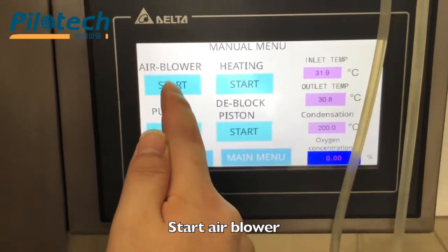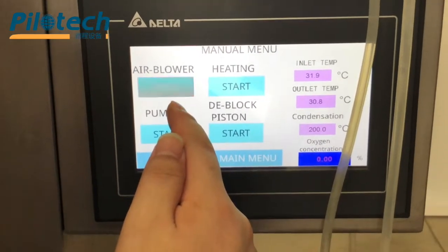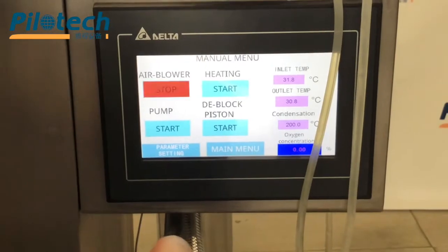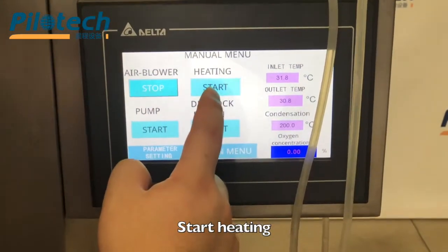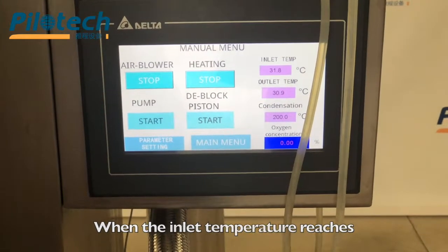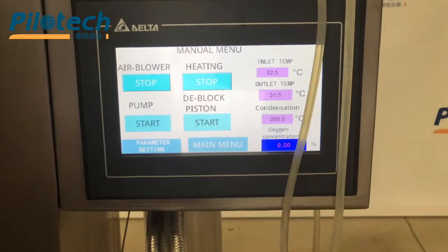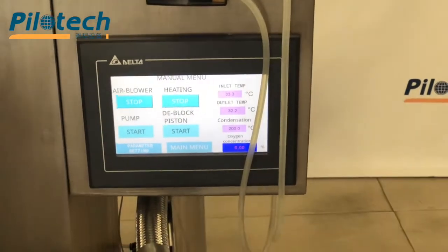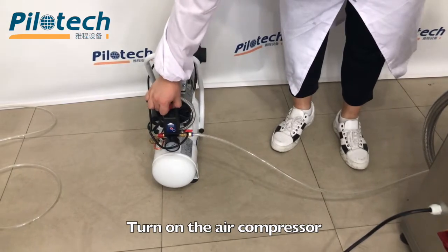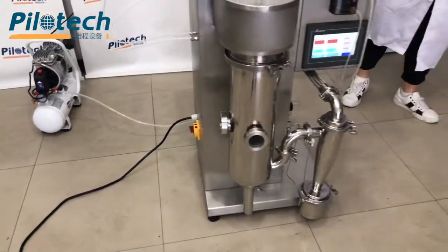Start air blower. Start heating. When the inlet temperature reaches the temperature set point, start the pump. Turn on the air compressor and start venting.